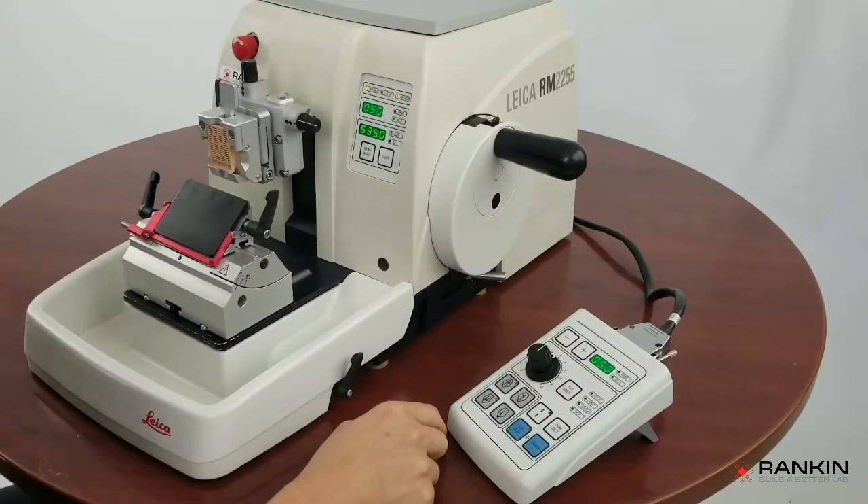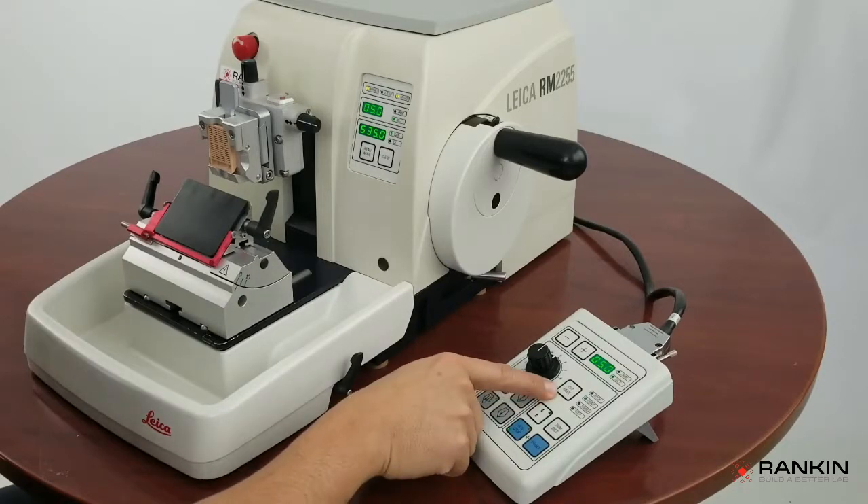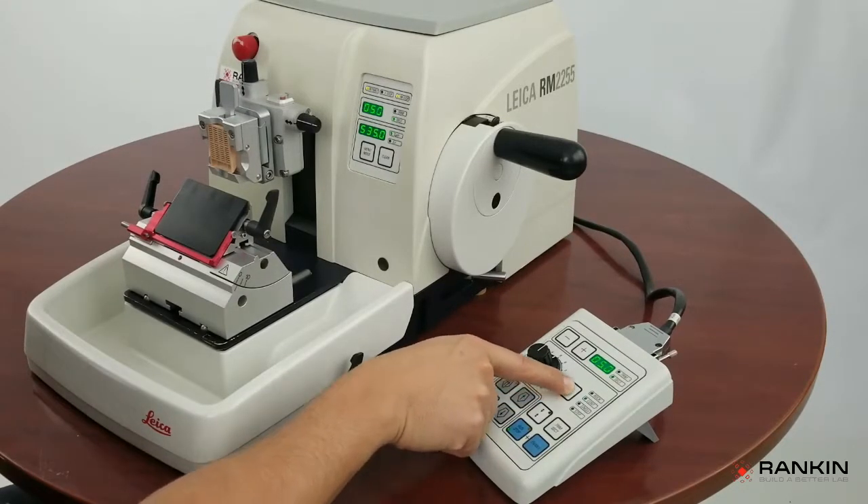I'm going to explain the cutting modes of this microtome, and you can toggle through the cutting modes by use of this cut mode button.